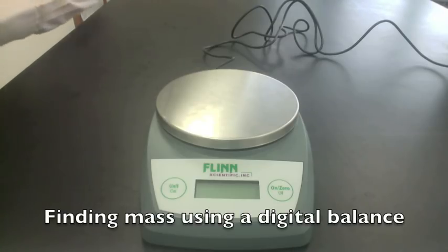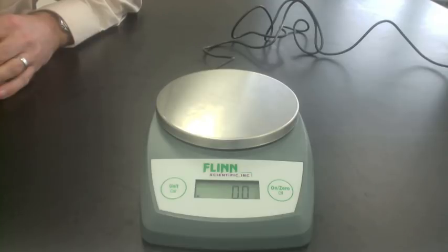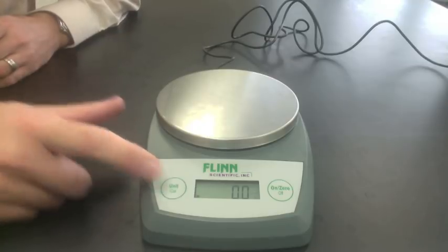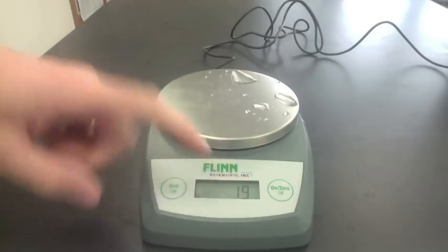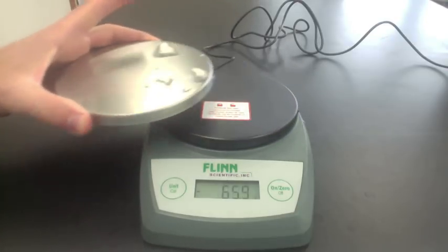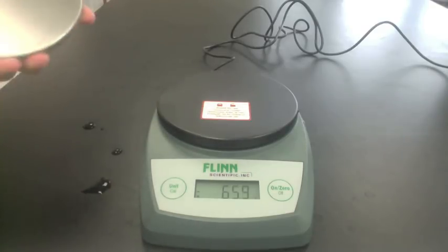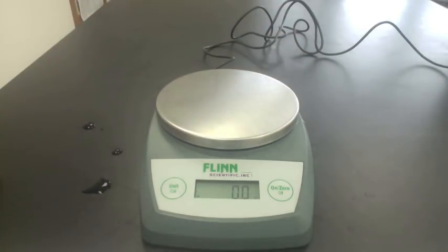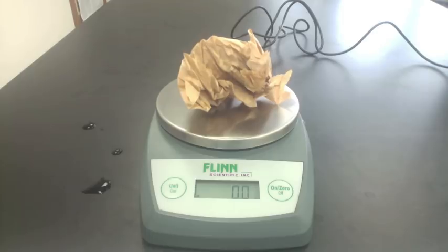We can also find mass using a digital balance. Turn it on. If the scale is not in the correct unit, hit the unit or mode button until it's in the correct unit. This can be in grams, ounces, or penny weight (abbreviated DWT). We want to use grams for mass. If the scale does not read zero, you can remove the metal pan and clean it — sometimes there's powder or liquid left over. The second thing you can do is hit the re-zero button, and that will cancel it out.